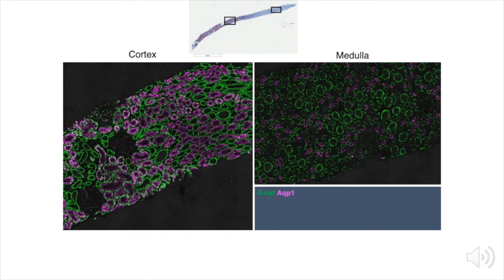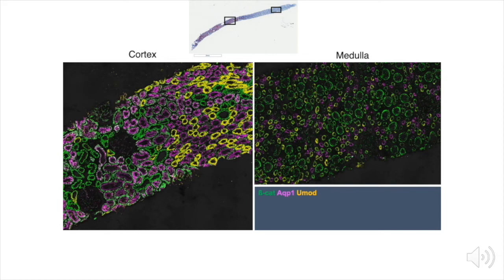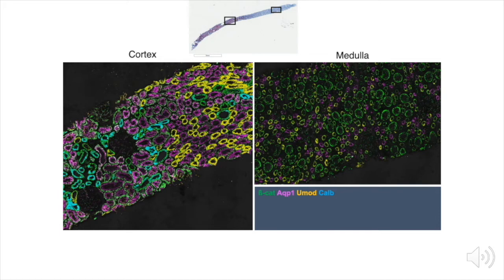Showing just aquaporin I and beta-catenin, we can start determining the identities of other tubular subpopulations, such as the ascending limb of the loop of Henle, defined by uromodulin expression in yellow. Note the thin appearance of the ascending limb in the medulla versus the thick appearance in the cortex. In cyan, I am showing the distal convoluted tubule, marked by calbindin expression, solely in the cortex. Collecting ducts are defined by cytokeratin 7 expression in white, as well as expression of the principal cell marker aquaporin II in blue, seen predominantly in the medulla.